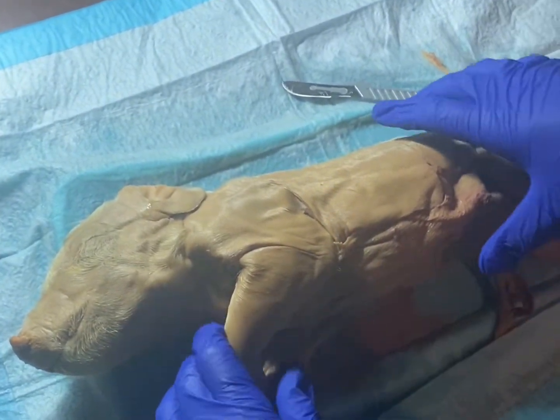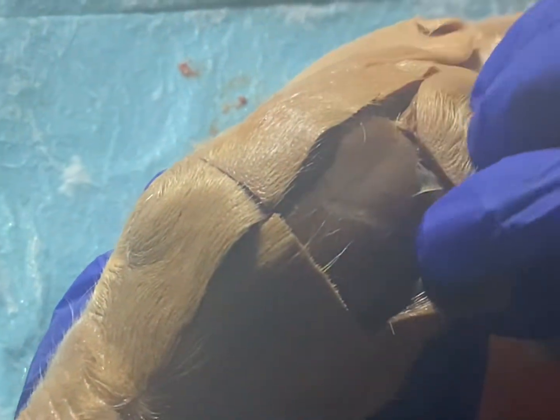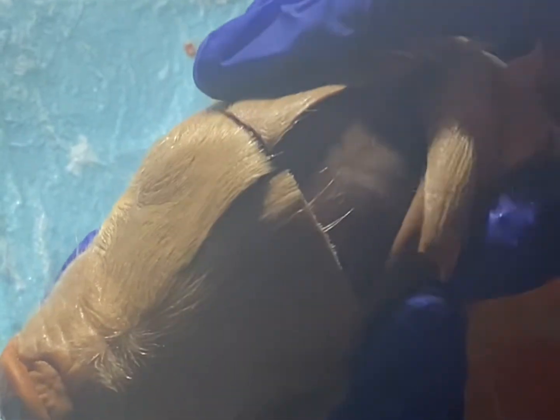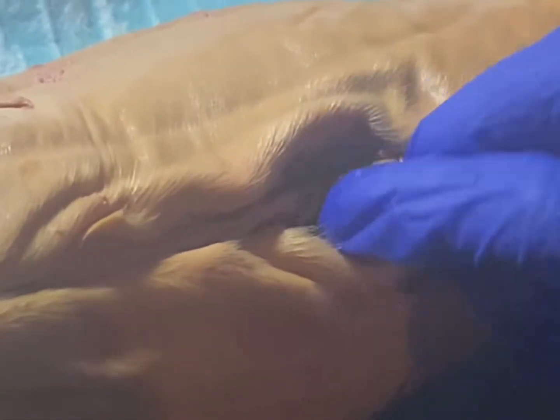Okay, so the first one we were asked to identify is the skull. I made a few incisions in here to visualize the skull. So here is the skull. The next system will be the vertebral column, which is a little bit hard to see, but I cut away a little bit, and you can see the vertebral column is right here.